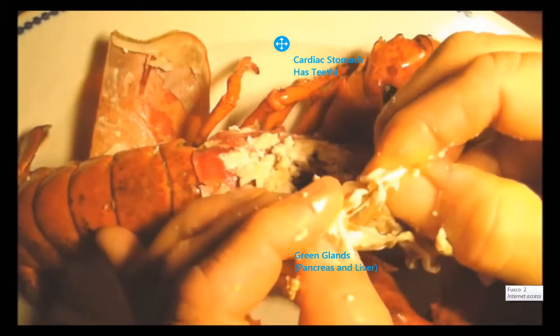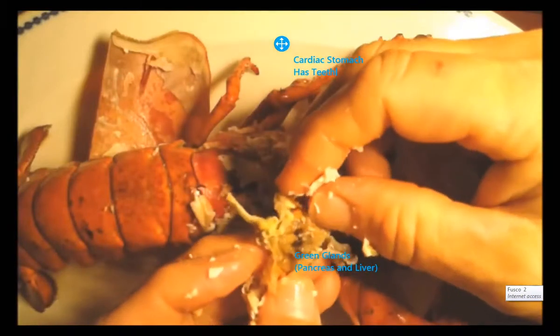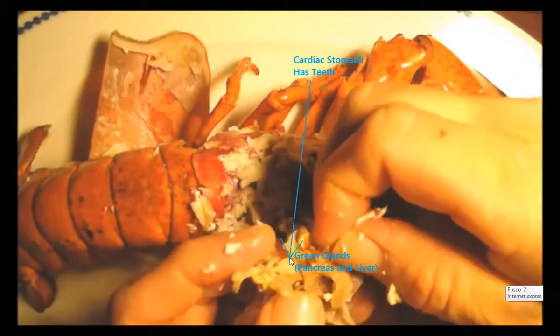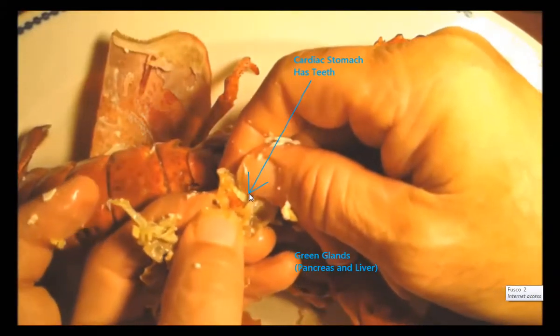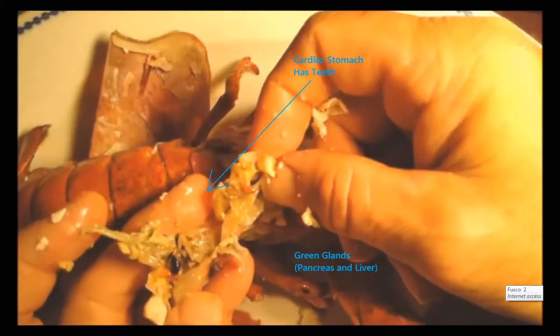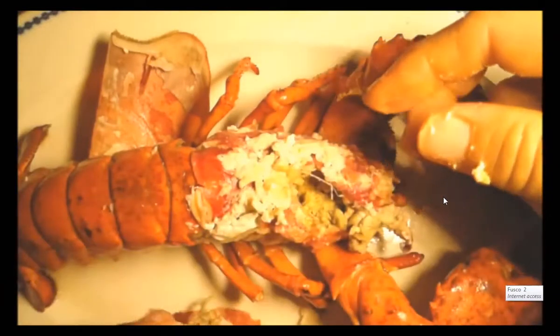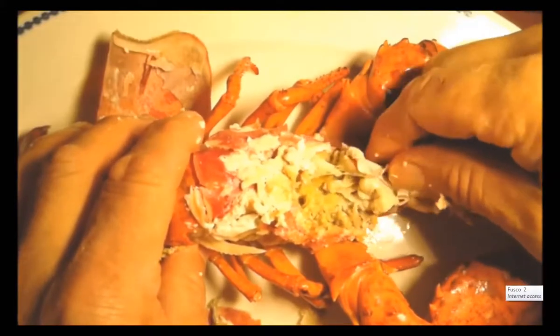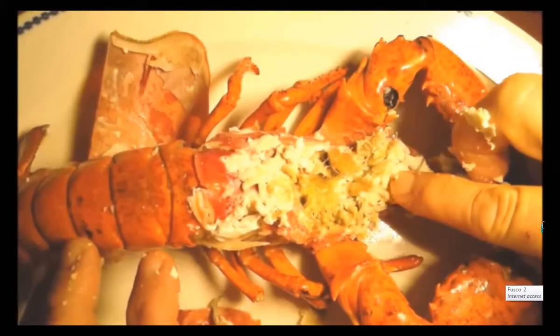If I remove the stomach, it's kind of hard inside. He actually has teeth in his stomach to help grind up food, which is kind of interesting. There are the teeth, and there's his brain in there.